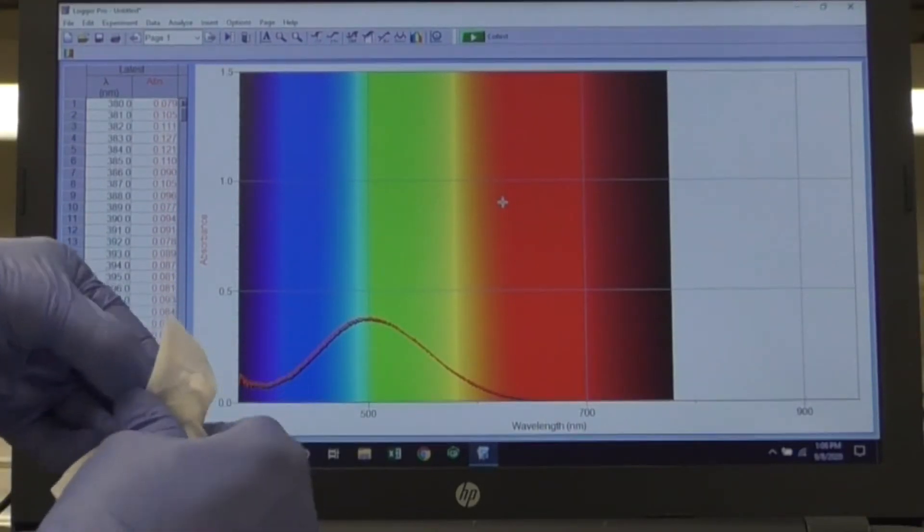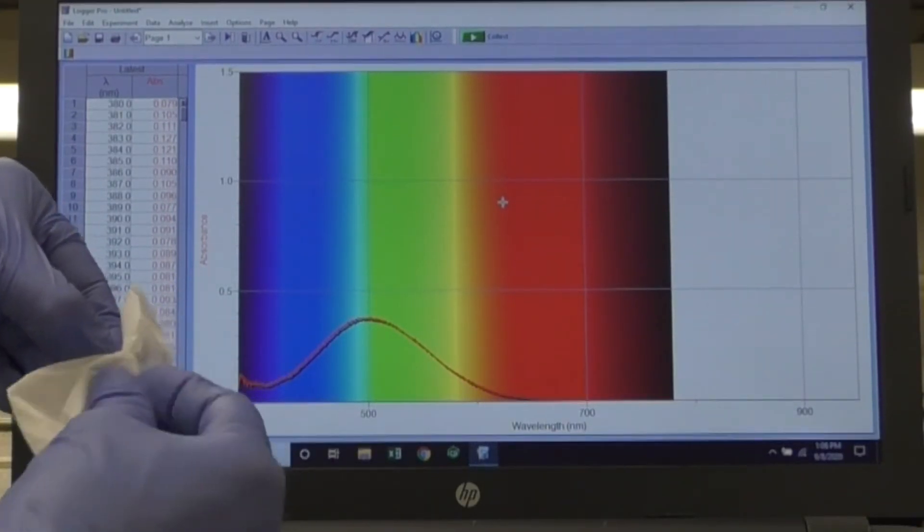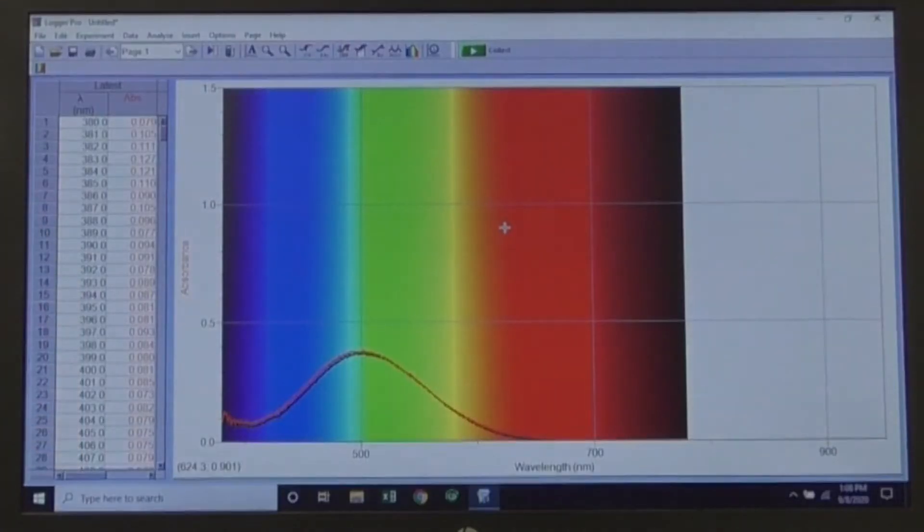Repeat this procedure with your patient sample when it is ready, being sure to click Save Latest Run. Use the examine tool to read your results at 500 nm.